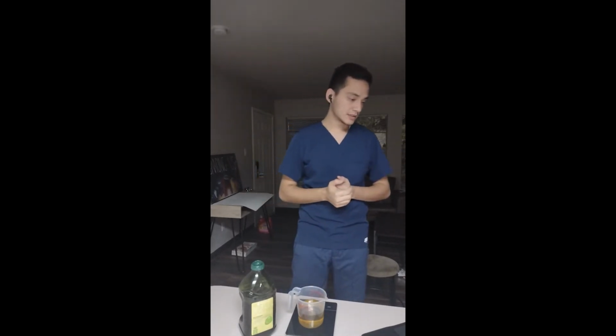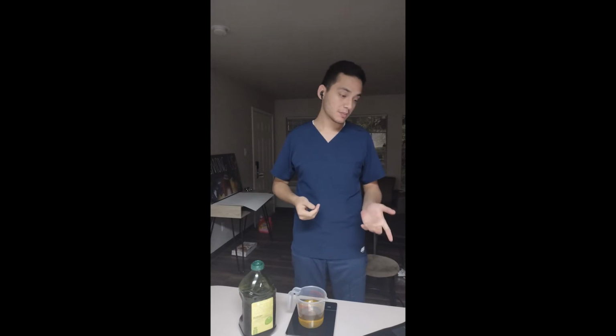Okay, so now that I'm done measuring the mass, all I have to do is graph it, and I can get the value for density. From our graph, we can deduce the density to be 0.956 grams per milliliter.